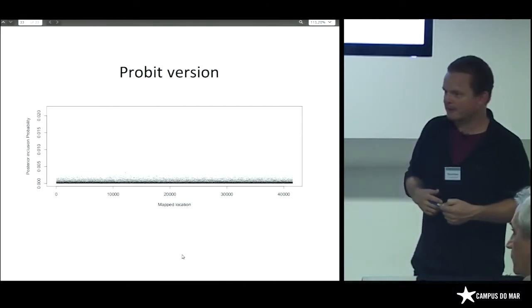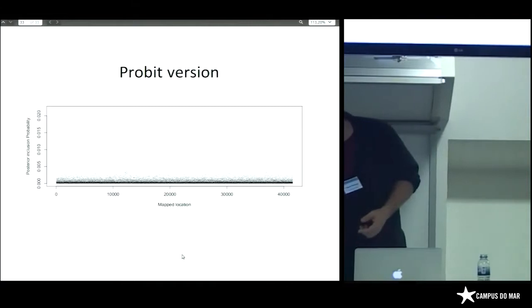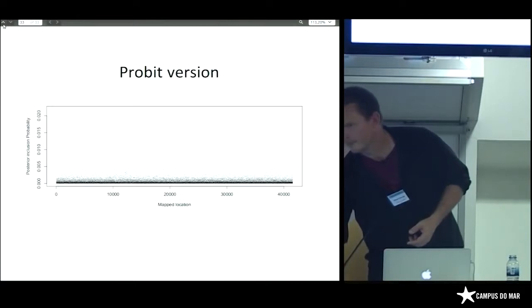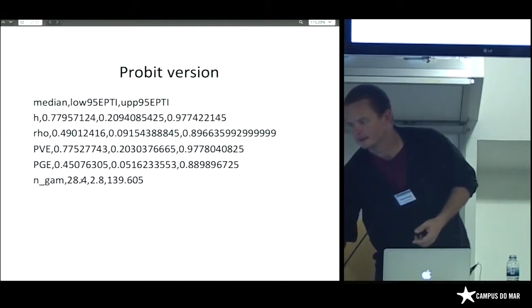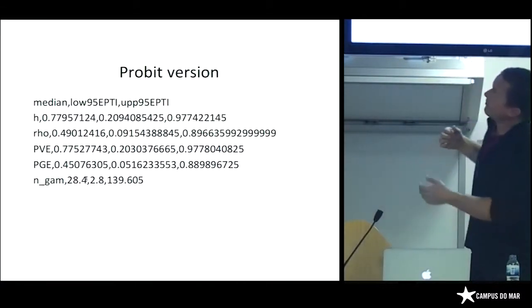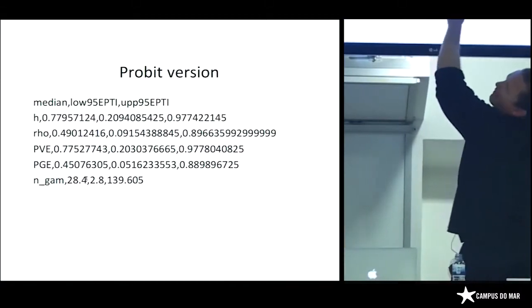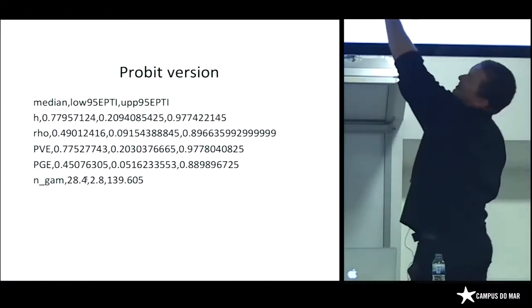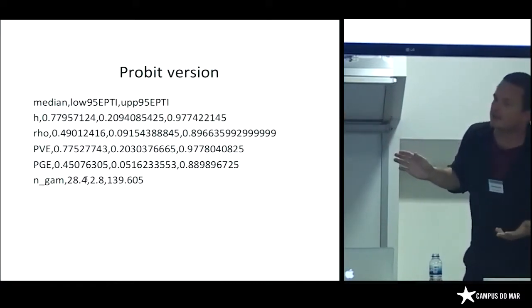It's good, with the summary table in the linear model. So here we have no association between the phenotype. That's correct. When you get to even that one, it's telling you that you have like a 77. Well, no, it's not, because look at our 95% credible intervals here. We've got between 5 and 90%, and the truth is in there somewhere. And I suspect it's much closer to this end, especially when we look at our posterior inclusion probabilities and see that there's actually no SNP that sticks out.